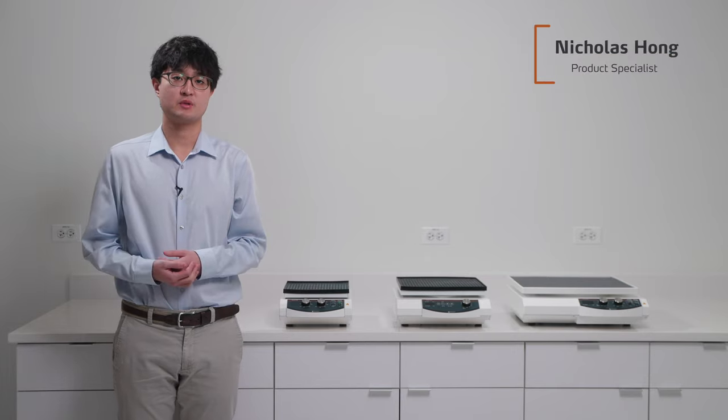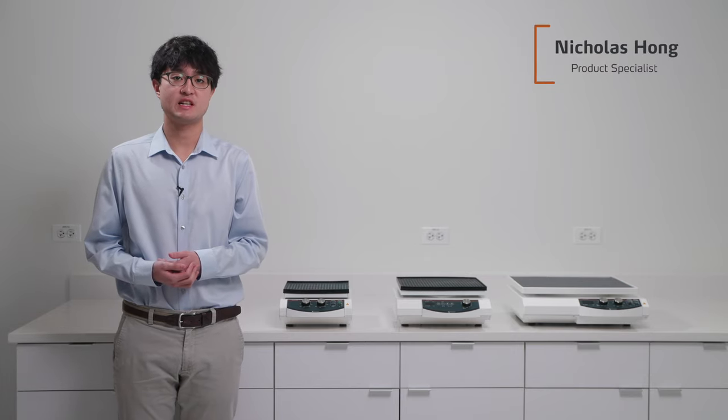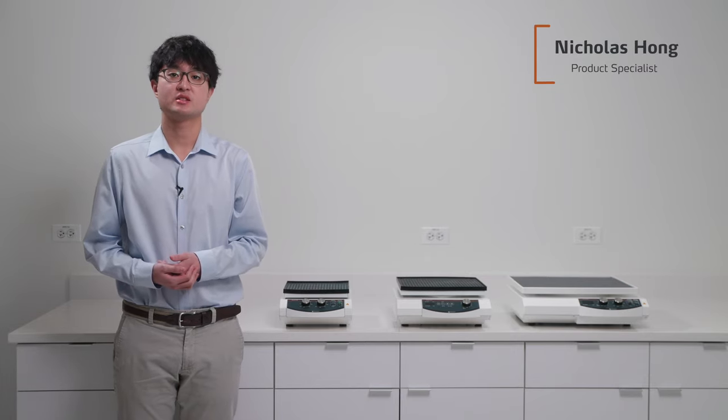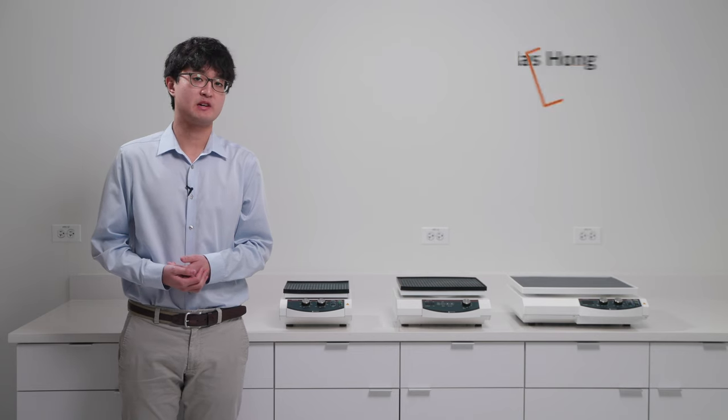Hello everybody, I'm Nicholas Hong, Product Specialist for Life Science Solutions at Heidolph North America. Today we'll be talking about three orbital platform shakers.